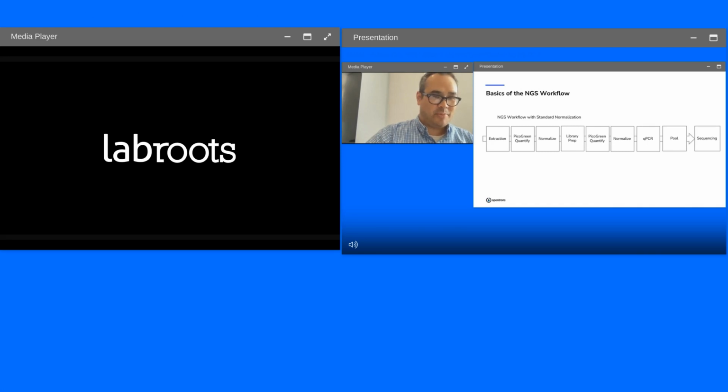Following that, you have your prepared samples, so you go through more quality control checks to make certain it's ready and able to be sequenced. Finally, qPCR in order to get a real accurate quantification of your sample, pulling them all together and then putting it on the sequencer. So my approach to doing this on the OT-2 is that each of these little blocks would be a separate protocol, and they're all run on the same robot.